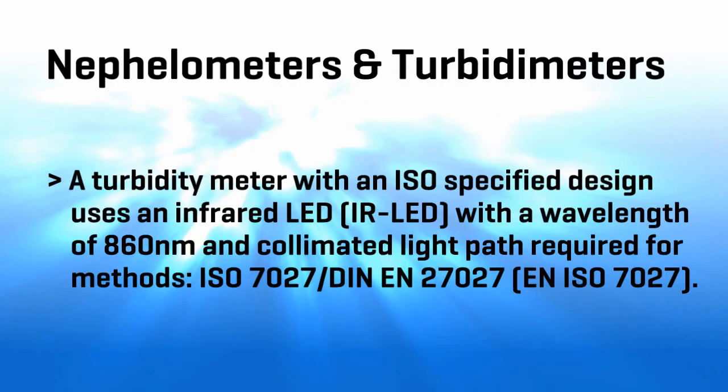So an ISO design will have that LED. Internationally, laws vary quite a bit governing testing of drinking waters and natural waters. There isn't so much of an exclusion for the LED when it comes to compliance-type sampling, and so you encounter the LED infrared type light sources more often. And again, they're a lot better at testing, certainly at higher ranges.